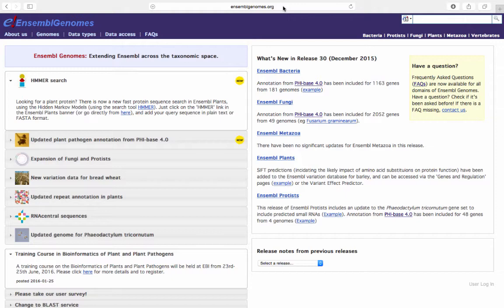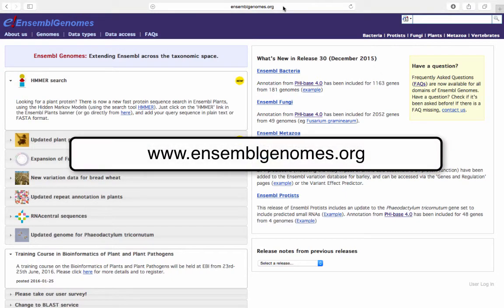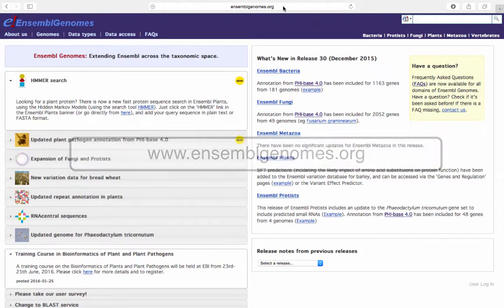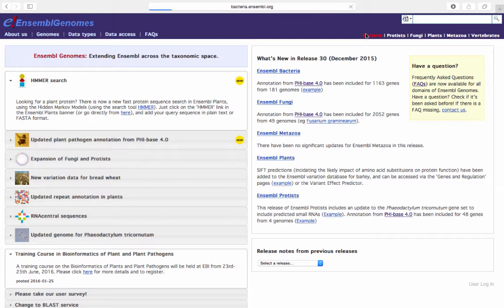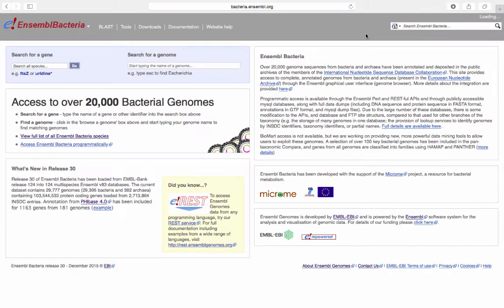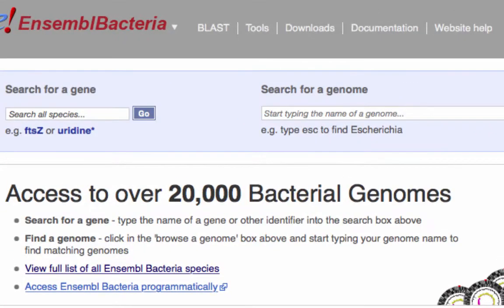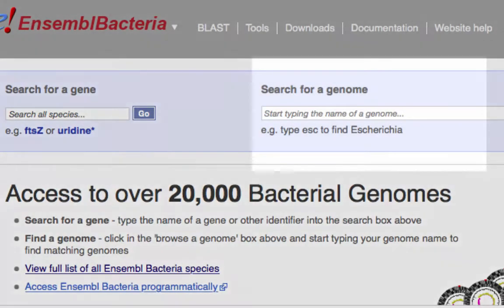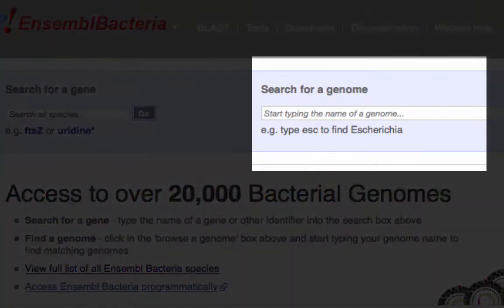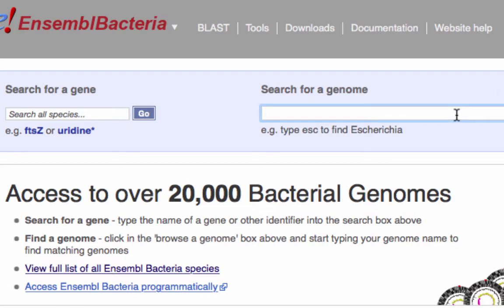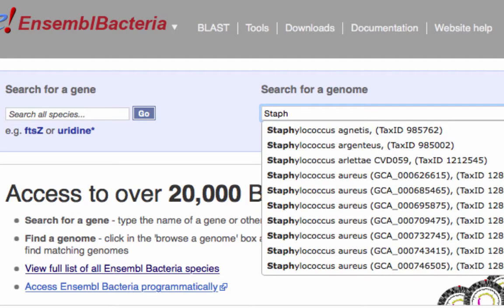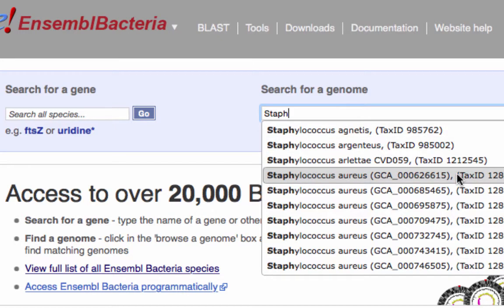From the Ensembl genomes homepage, www.ensemblgenomes.org, click on the link for Ensembl bacteria. There are two search boxes. The first allows you to search for genes. The second allows you to search for a genome using an autocomplete function. Let's find the genome for Staphylococcus aureus. Type Staph into the search box. By beginning to type the bacterial species of interest, you are prompted to select the bacterial species from the drop-down list. Select Staphylococcus aureus.